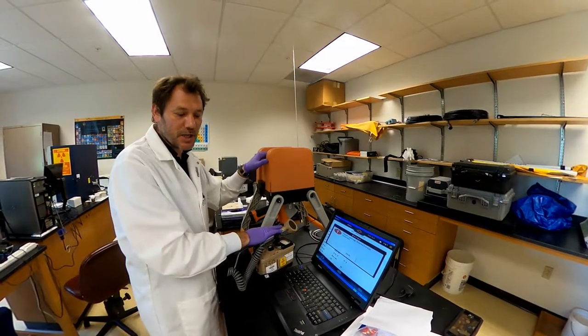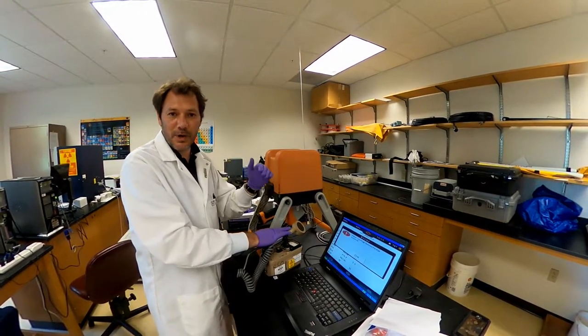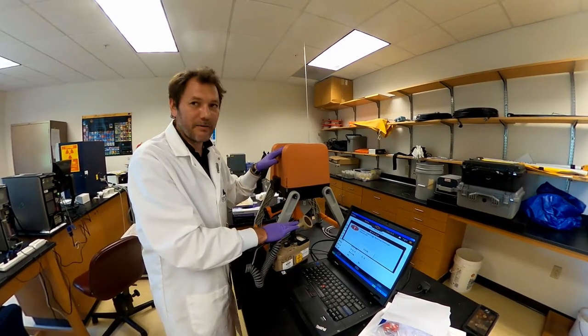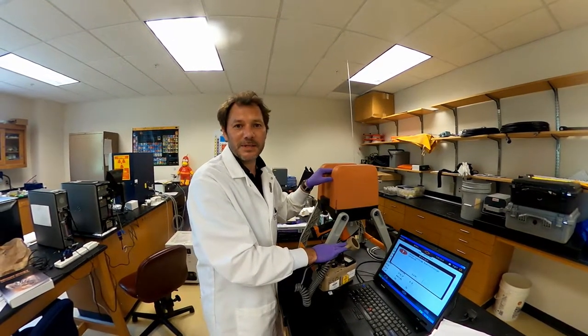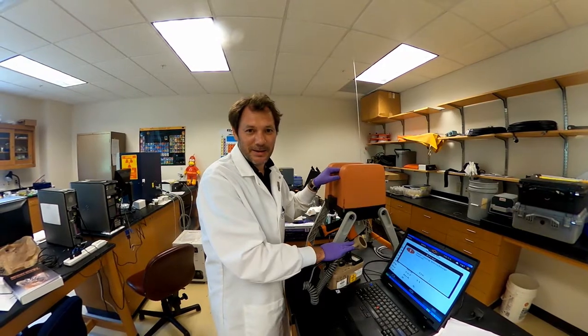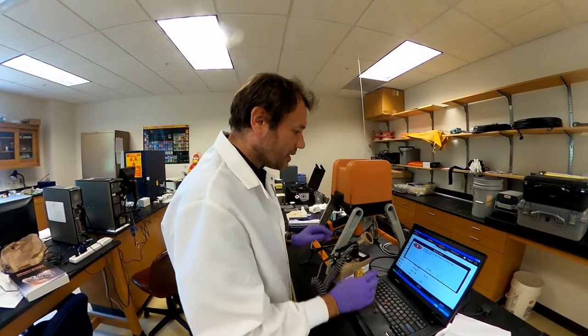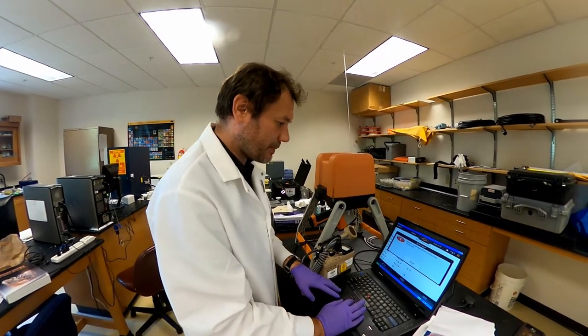If we don't have the x-ray shield, by bypassing the security with the x-ray officers at university, the dose that would be arriving to a human being would be 20,000 times higher than what is allowed for safety. So, let's look at one thing to finish there and I will run the other samples independently.